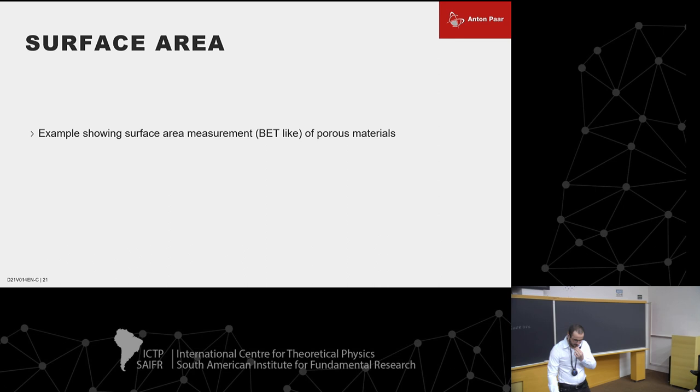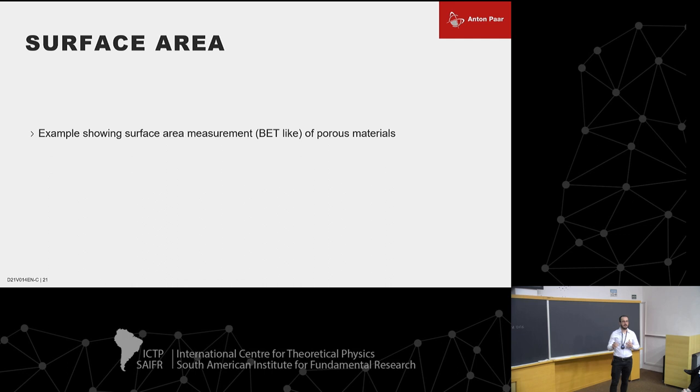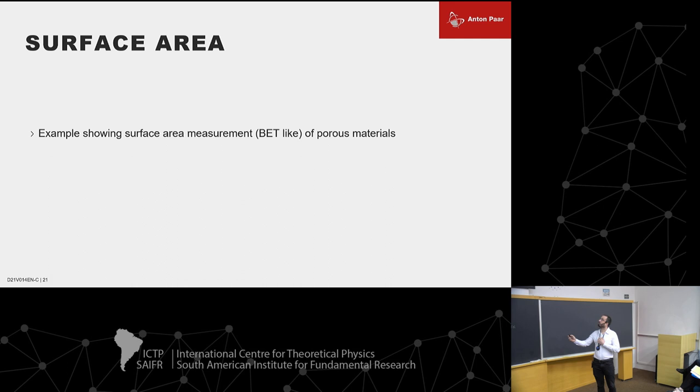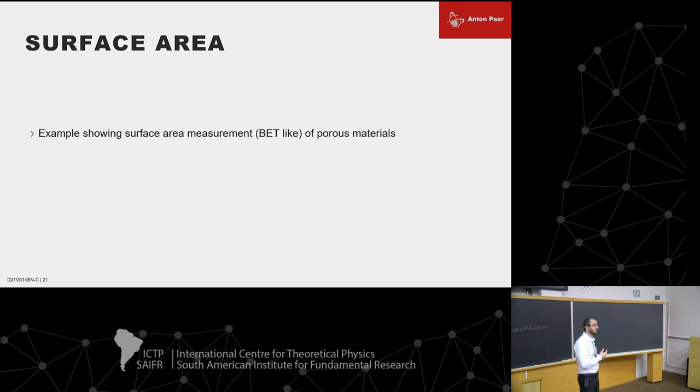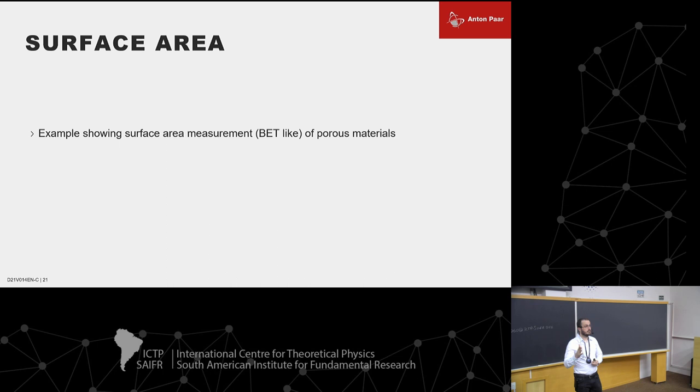These slides are really interesting because we are showing that, in substitution to BET physisorption, the traditional technique to determine specific surface area, we can do the same with a SAXS instrument. This is focused on mesoporous materials, and the basic technique to characterize mesoporous materials is physisorption with argon or nitrogen. Several authors discuss the difference between argon and nitrogen. Nitrogen is used because it's less expensive, an easier gas to work with. IUPAC, for example, recommends the use of argon because nitrogen is a diatomic quadrupole molecule, while argon is monatomic and has no quadrupole moment. So there are significant differences between the specific surface area determined using argon or nitrogen.